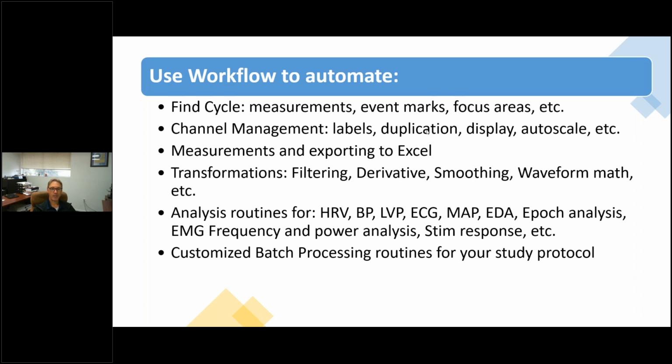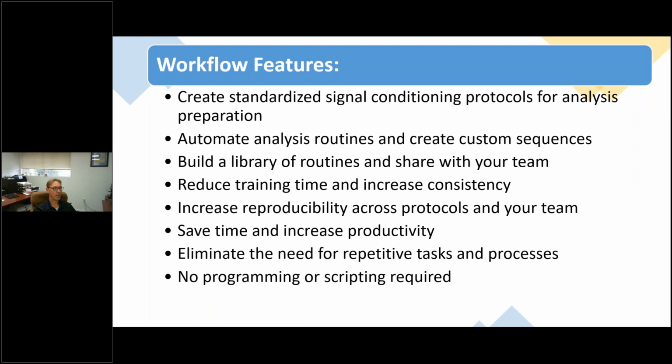You'll then have the scoring of the waveforms and then the measurements extracted for those 5 files. So it's pretty elegant in terms of standardizing what you're doing, because it's going to perform exactly the same task every single time it runs the workflow. It automates everything, obviously, which saves a lot of time.